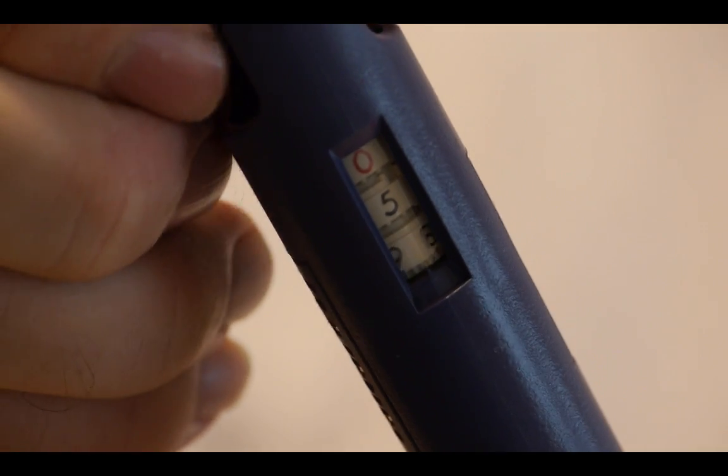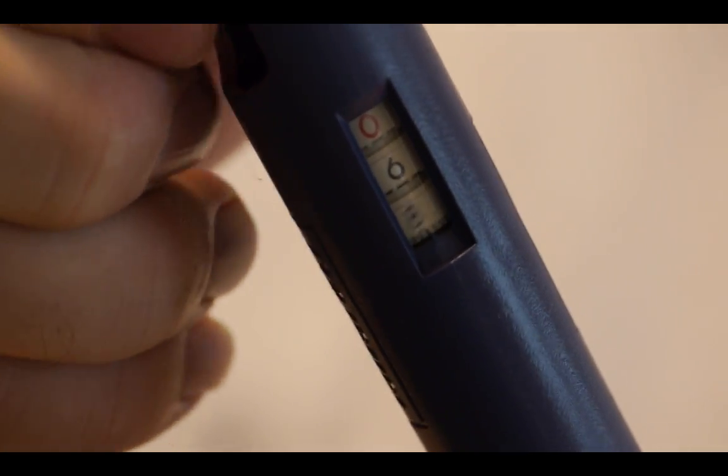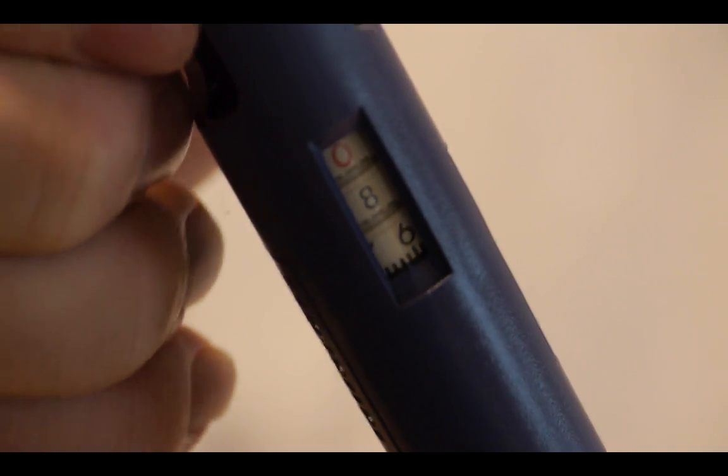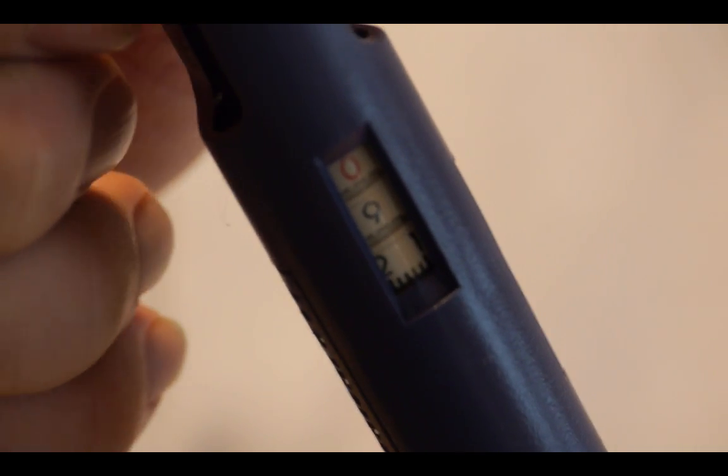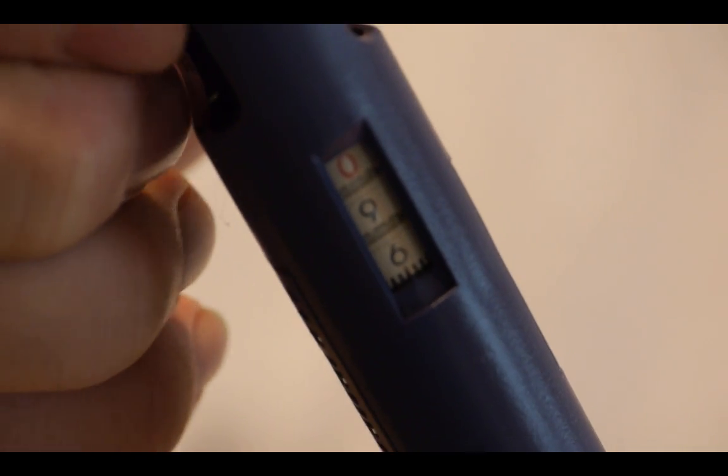The P1000 can be set to the desired volume by rotating the black wheel at the top. Here we are setting it to 1 ml. The P1000 will read 100 when at 1 ml.